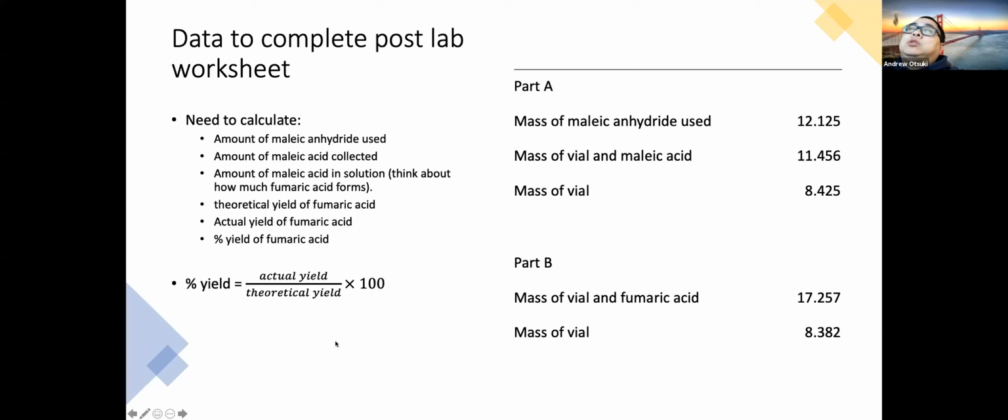For percent yield, there are going to be some actual questions in the post lab too, as examples to practice calculating theoretical yield and percent yield. If you're having trouble doing it here, you're going to have trouble doing it in the post lab questions too. So come see me for help if you have any questions about how to calculate theoretical yield for any chemical reaction or this reaction. Okay, everyone, that is it for this experiment.